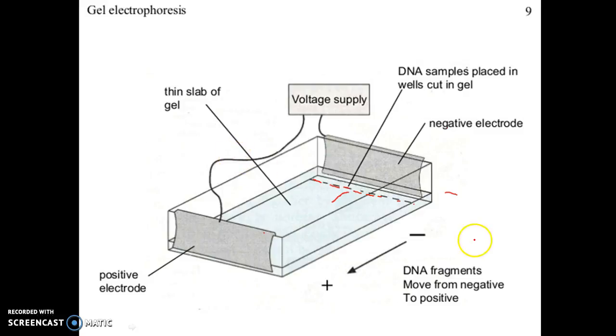The reason why they can do this is the gel is like SpongeBob. It has a bunch of holes in it. They're definitely not that big. They're so small, they're like microscopic. But it's made up of a bunch of holes, like air pockets, and the proteins can actually travel through the holes, which is pretty cool. We have soaked them in blue dye, so you'll actually be able to watch them. It'll look like a blue band. I know that's red, but whatever. And it'll travel along through the gel.